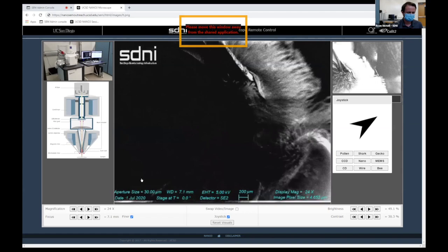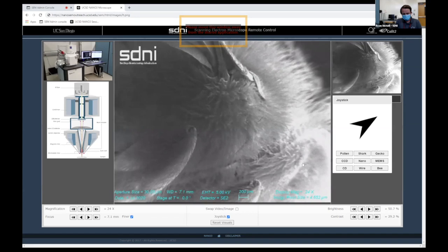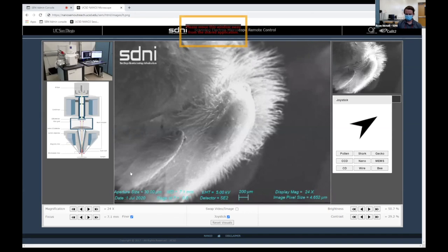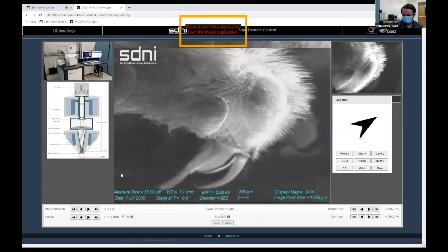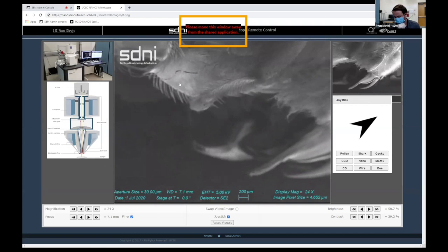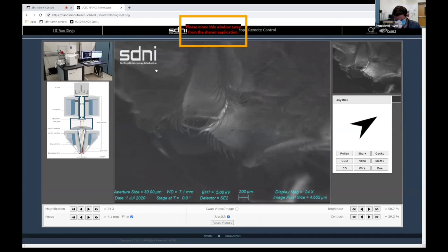So I just wanted to add to the color. A lot of the time it comes out as a black and white image, but you can colorize it. There's a lot of people that do false coloring. That false coloring is just someone adding color to what is technically a black and white image. And then Amrit is asking, does that mean the darker bits on the nanoparticle are different from each other? Like the darker ones are different elements or something from the light source? So it could be, it depends.